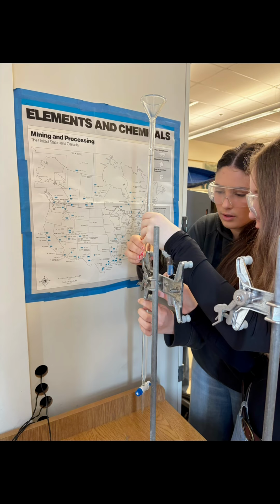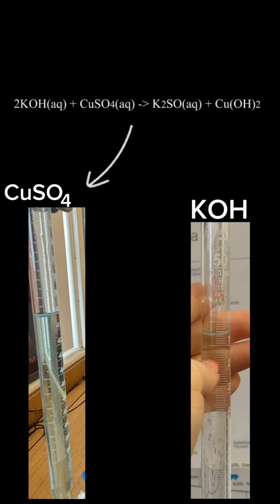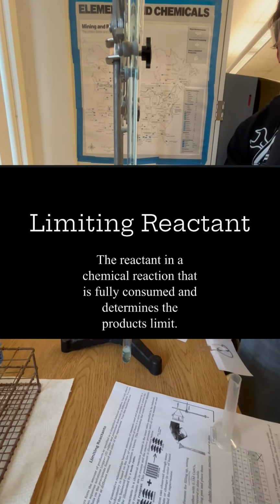The objective of this lab was to determine the limiting reactant of the chemical reaction of 0.2 molar KOH, which was a clear water-like liquid, with 0.1 molar CuSO4, which was a water-like liquid with a blue tint, to make potassium sulfate and copper(II) hydroxide at different ratios. The limiting reactant is the reactant that limits how much product is made.